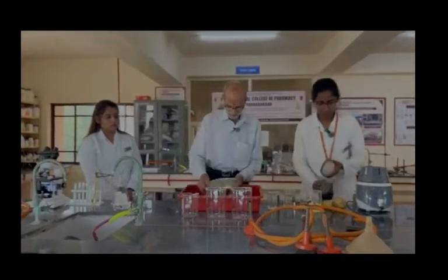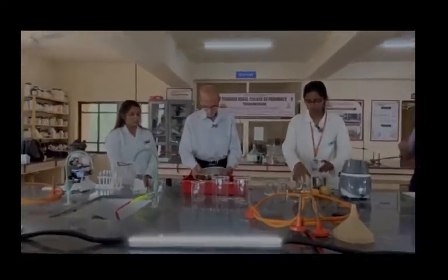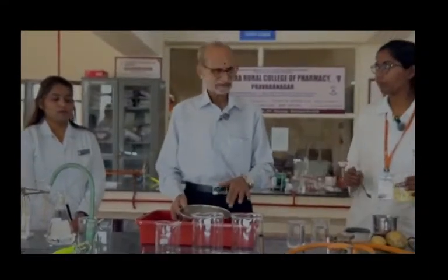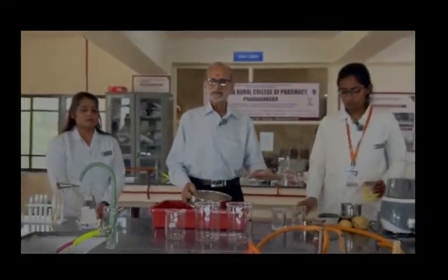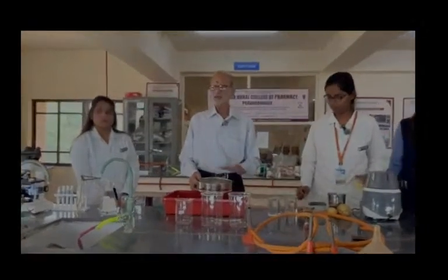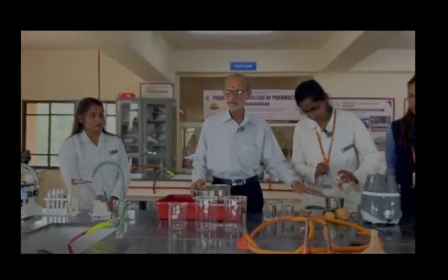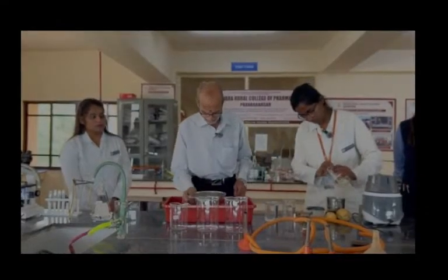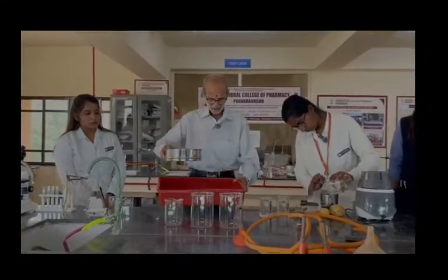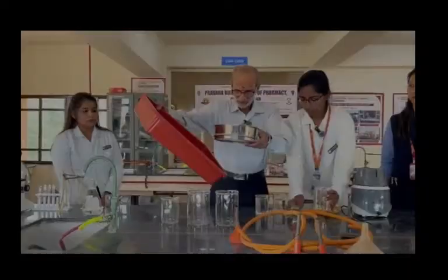Okay, so now you can see here. We have put a little citric acid because potato contains the enzyme peroxidase, and if you don't put citric acid, it will start becoming brown. So if you want absolutely white starch, you need to put a slight amount of citric acid in the cut pieces. We have passed it through this. Now you can see here the starch, which we are going to transfer into a beaker.